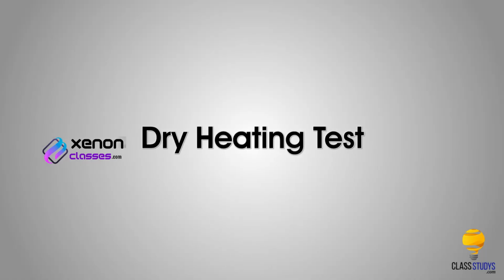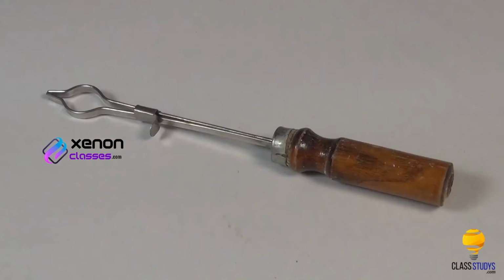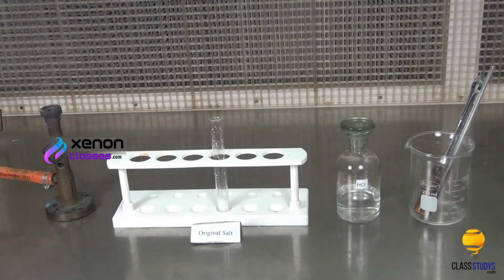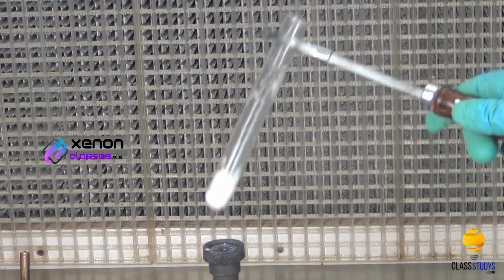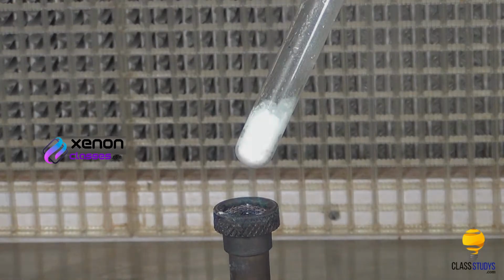Dry heating test. Materials required: original salt in a test tube holder and Bunsen burner. Procedure: take a small quantity of salt in a test tube, heat it over the Bunsen burner. A white residue glows on heating, indicating the presence of strontium ions.